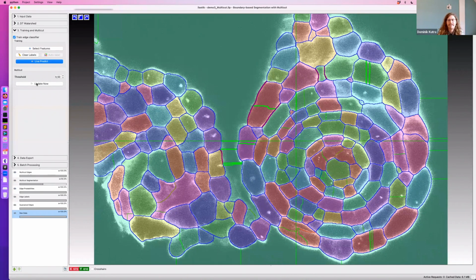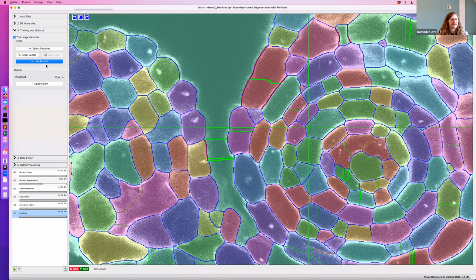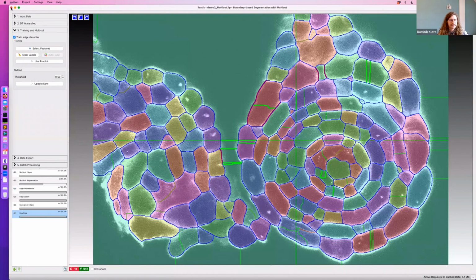No. Okay, no. Good. Yes. So that's for the multicut.